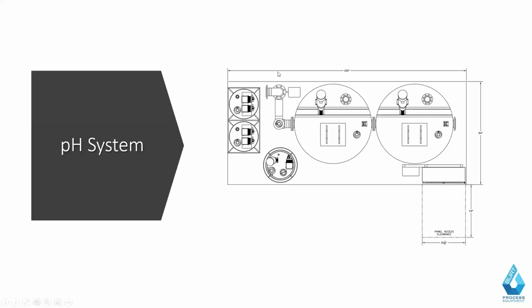As you can see, these systems can get pretty big, obviously. So something definitely to account for at over 200 inches long and 7 feet wide with access. It's not uncommon to split these systems up if needed, especially for access. They split them here, have one tank this way with the panel, one tank this way with the reagents on there. Or the tanks can obviously ship loose in those cases. In this case, they can just knock down a wall and bring the system in.